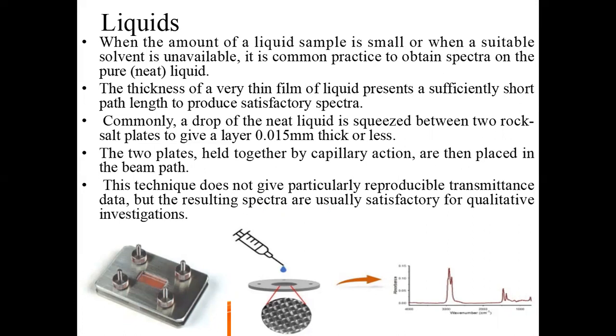And in this diagram, at the left side are the liquid holders which are used, and we can see there is a dropper which drops the liquid on the liquid holder, and at the end the detection occurs, and we get this kind of spectra.